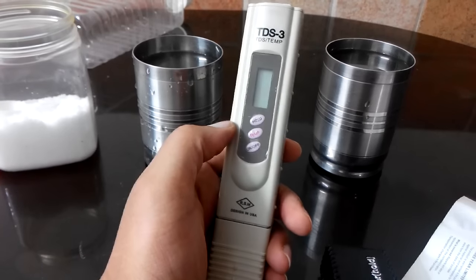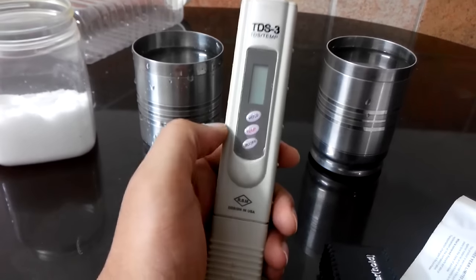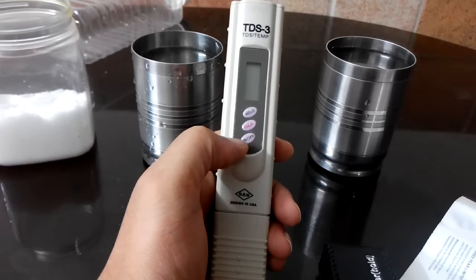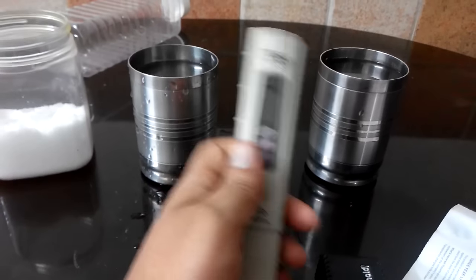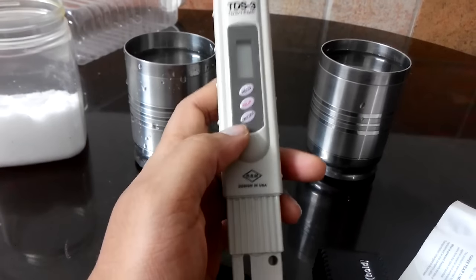Let's take a look at this device itself. It has a display here. This is the hold button, temperature button, and on-off button. You can actually measure the air temperature or water temperature using the temperature button.